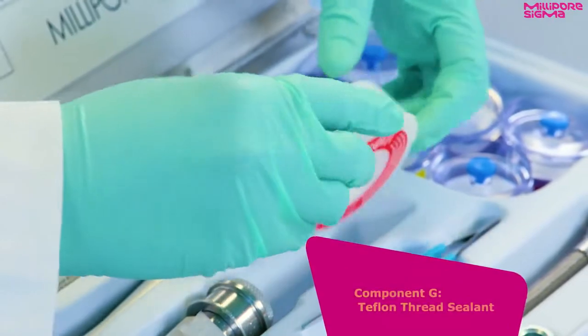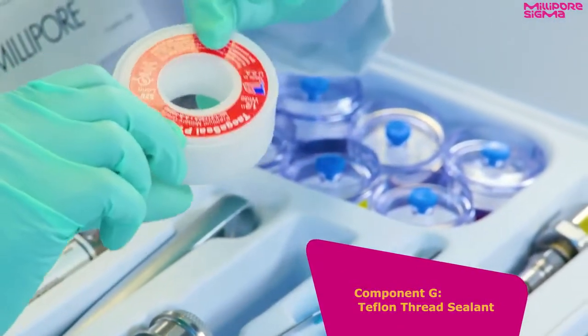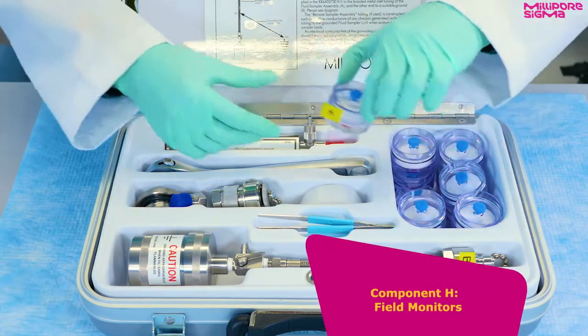Component G is the Teflon thread sealant. Component H is the field monitors.